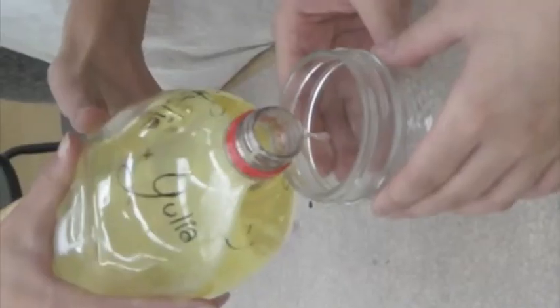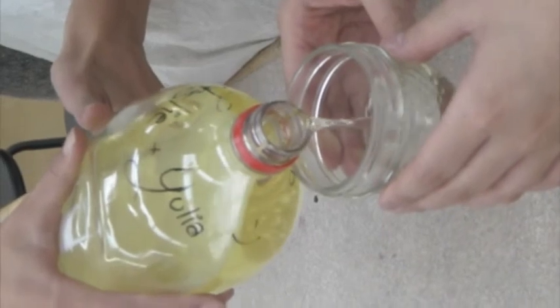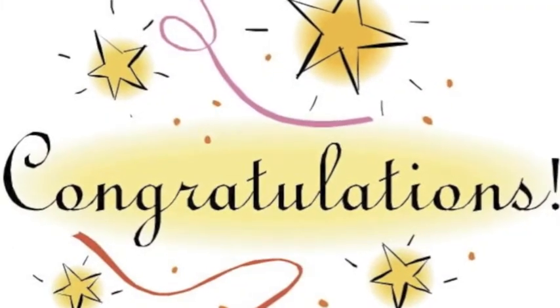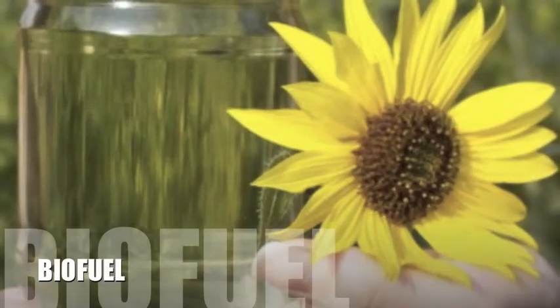Step 14: Pour the top layer of oil into a mason jar and safely dispose of the leftover waste. Congratulations! You have now created biofuel!